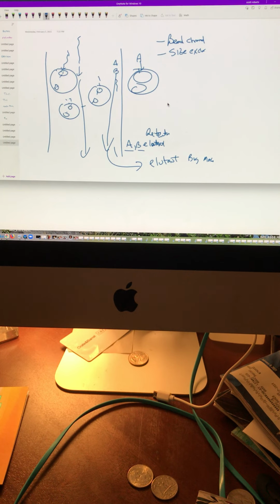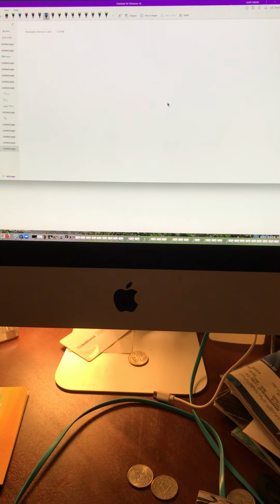So we adjust the resolution. Unlikely, but very unlikely. Almost exceedingly unlikely. I agree. Okay, cool. Happy times. That's bead chromatography. That's definitely one of my favorites.